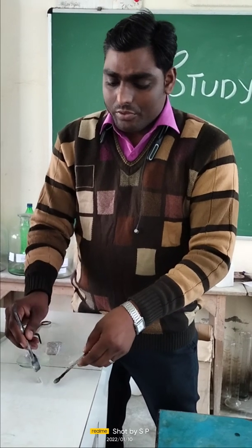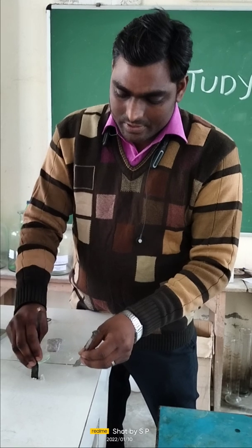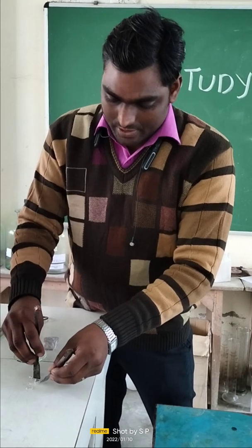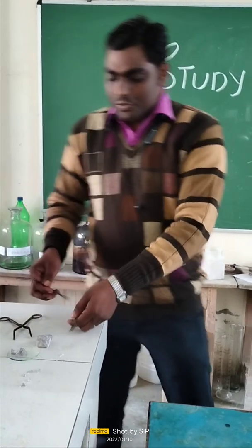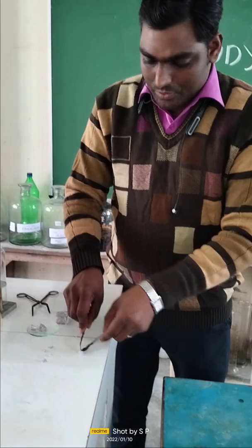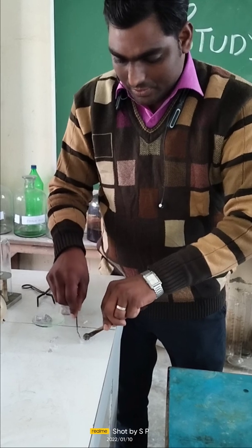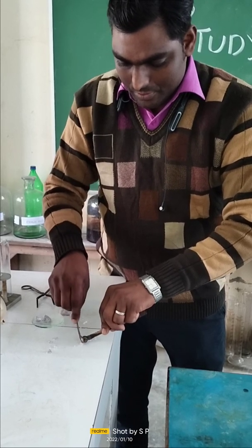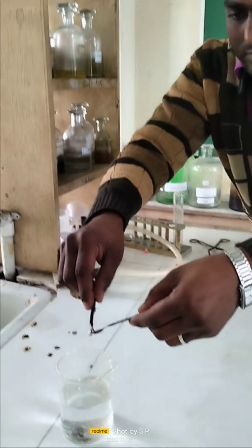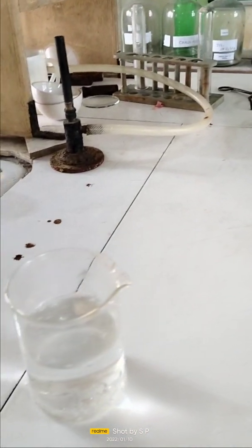Today I am going to show you the reaction of this sodium metal with acid and with water — see how the reaction occurs when it reacts with water and with acid. First, I am going to show you the reaction of sodium metal with water. Since sodium has the ability to burn when it is put inside water, I am going to show you how it reacts with water. See how it reacts rapidly with the water.